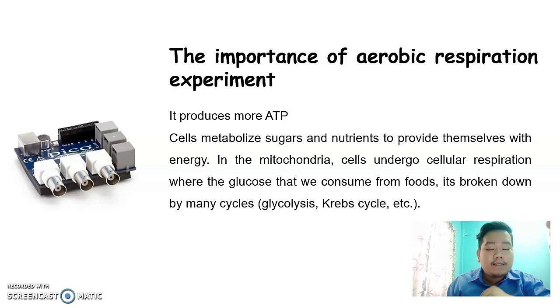So the principle is that the stomach produces HCl, and this acid provides a medium for digestion of protein by the enzyme protease. So that's the other specialty about this instrument. So back to the importance of aerobic respiration experiments.